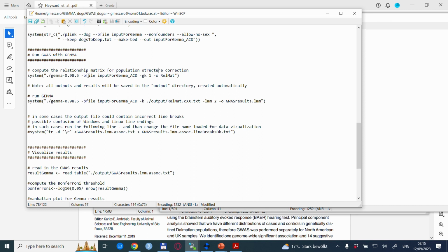And the later on is right after, actually, because the actual GWAS is run in this line. So we execute GEMMA again with ./gemma and the exact file name. This file name might change depending on which version of GEMMA you have, but this is the recent one that I've used.